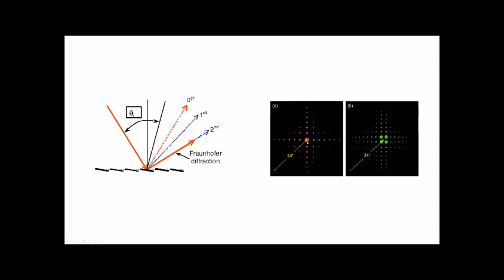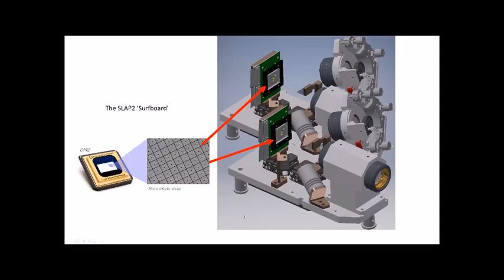It's very important to collect only one of these diffraction orders, because very small changes in path length will make different diffraction orders no longer sum coherently. And so you have to do a lot of work in order to use DMDs with laser light. With that said, we use DMDs with laser light in this microscope because we really want to take advantage of all the power that being able to turn these pixels on and off extremely fast allows us to harness.